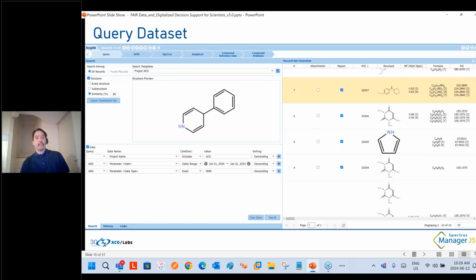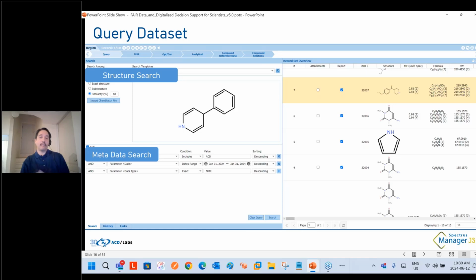Now, once you've done all of this data organization, what are the common things that you may ask and want to view? And just like I mentioned with the skeptical analytical chemist, the capability here of just doing multiple searches. So a user can just go into structure, do a similarity search, substructure, etc., but at the same time do a metadata search. The capability of looking at an ELN number, sample ID, project, process, and query your results. Everything in one interface. Being able to understand what's occurring and have we seen these types of impurities or this type of compound before.